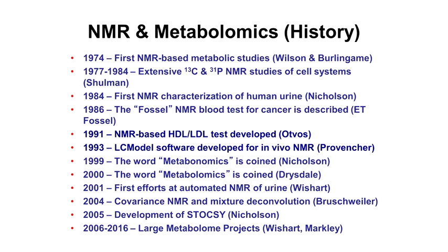This led to a software tool called LCModel, which was largely ignored by the NMR spectroscopy community for 20 years, because I guess MRI people don't talk with NMR people. In 1999, the term metabonomics was coined by Jeremy Nicholson. And in 2000, the word metabolomics was coined by Drysdale. For about 10 years, there was a battle between the two over what you should call it. The word metabolomics won.